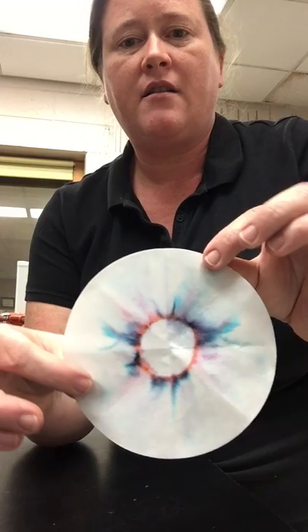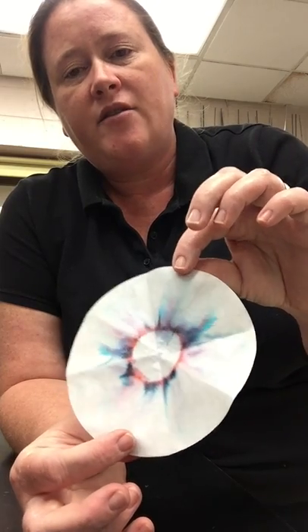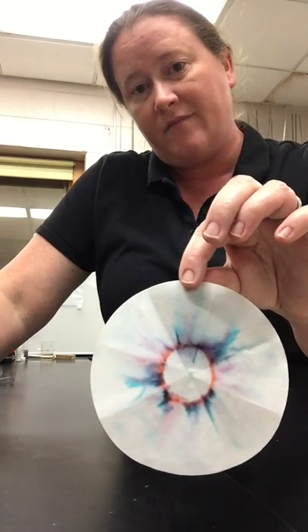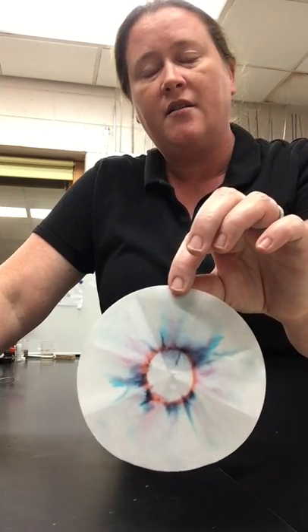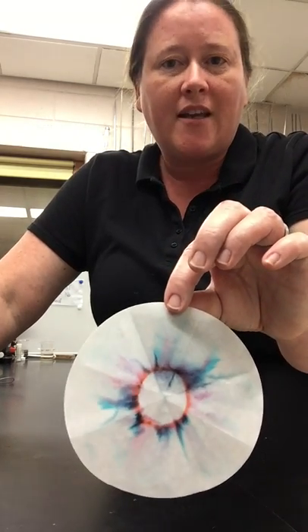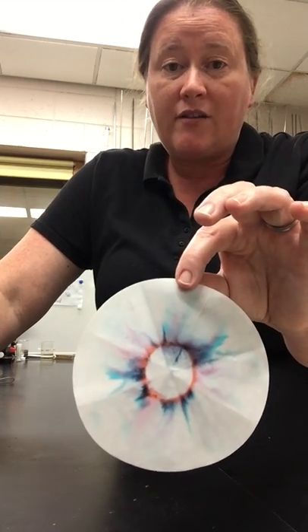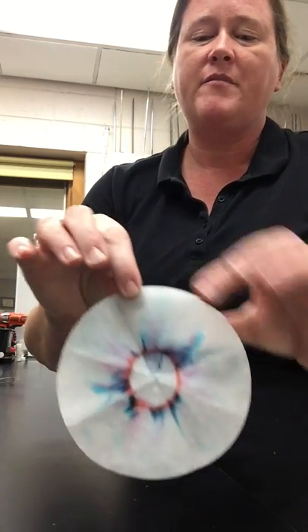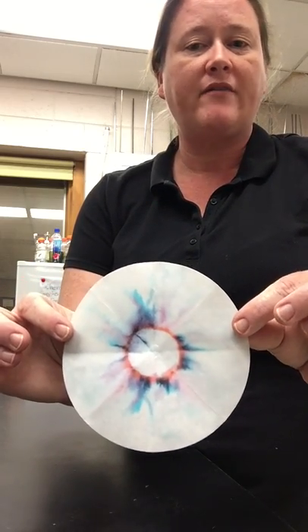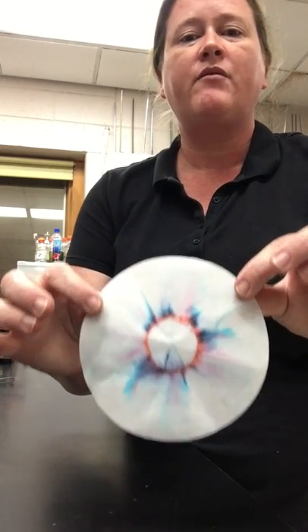As you can see, the colors have been separated. This is a method called chromatography, and it may or may not surprise you, but this is a method that can sometimes be used to identify unknown inks — like in criminal forensics with ransom letters, or investigations where somebody signed something on a piece of paper and they're trying to link it back to an ink or see if something's been forged. Chromatography is a method for doing that, and it is used in real life.